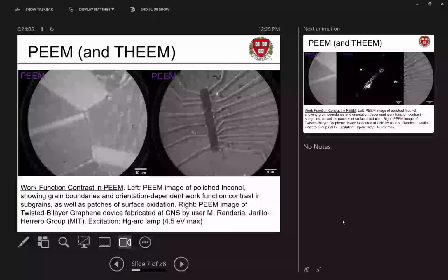So these little dark striped shapes in between all the big lines are little tiny sections of graphene that someone very carefully shaped in the clean room. And then they attached these gold contact leads to them so they could do electrical measurements on their interesting graphene. But we can image it directly. We can look at its surface. We can do all the various crazy microscopy tricks this cool tool is capable of right on your graphene.